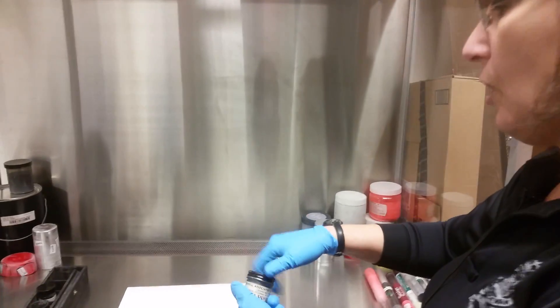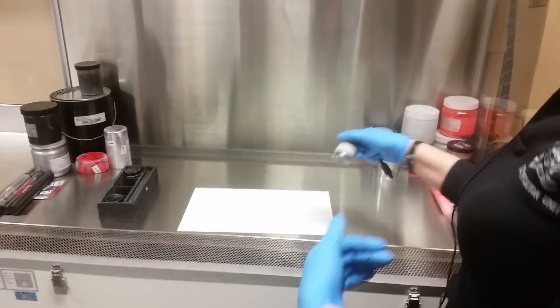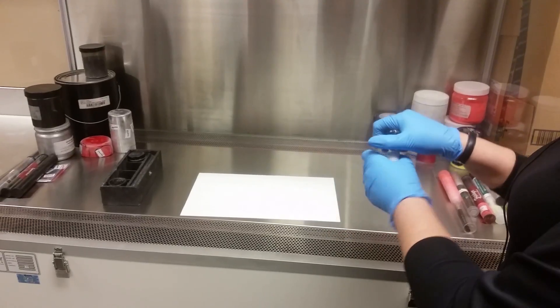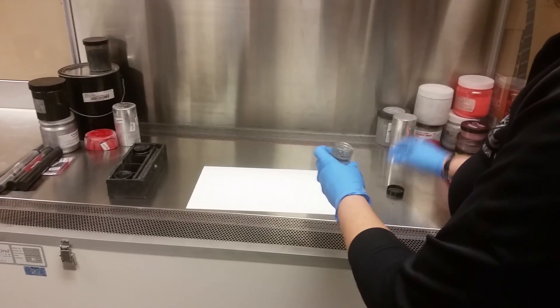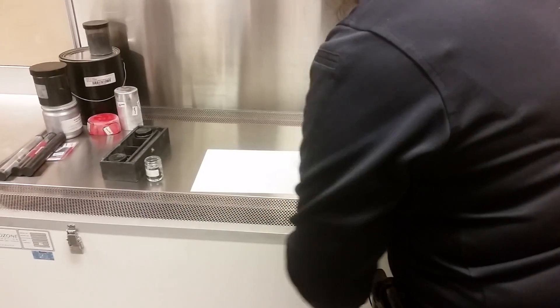And this would be on whatever surface. If you believe someone has touched something, then we'll test for fingerprints. And again, there are several different ways that this can be done depending on the object.